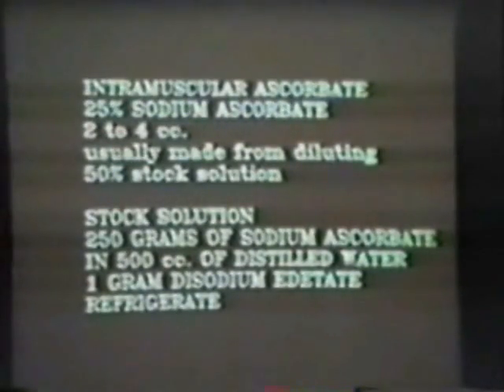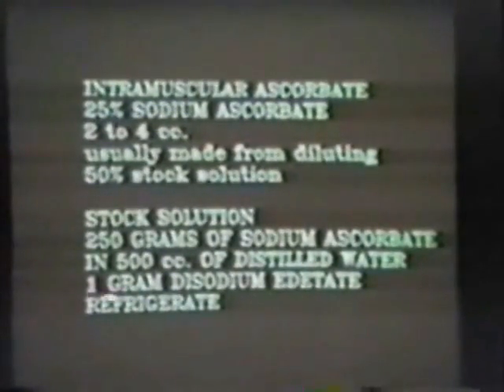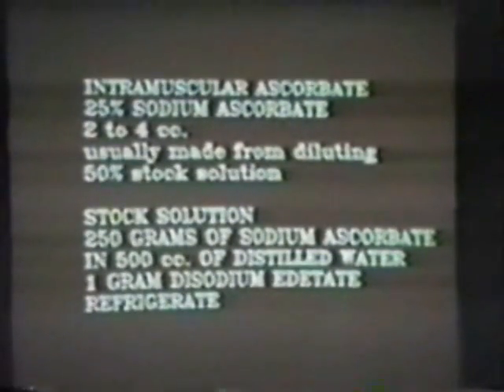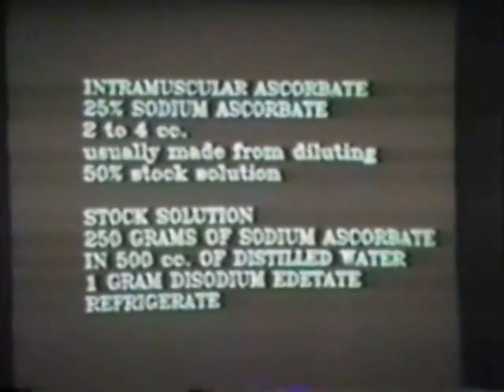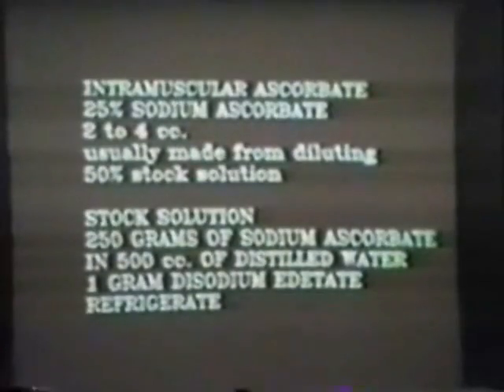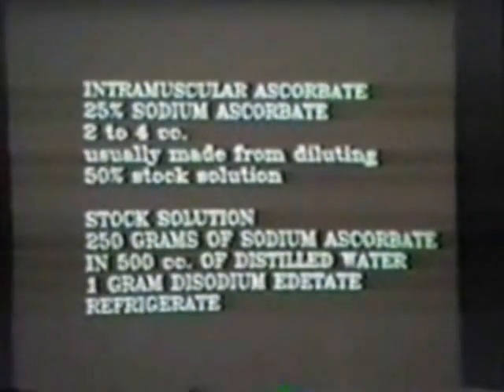And then I add 1 gram of this sodium EDTA, you know, the stuff that we're using for chelation therapy. The purpose behind that is to chelate any stray atoms of copper or iron that would enzymatically destroy the solution. So this is the stock solution.